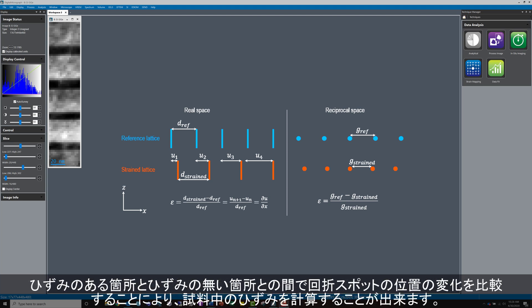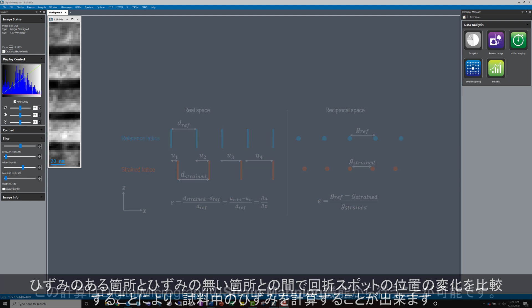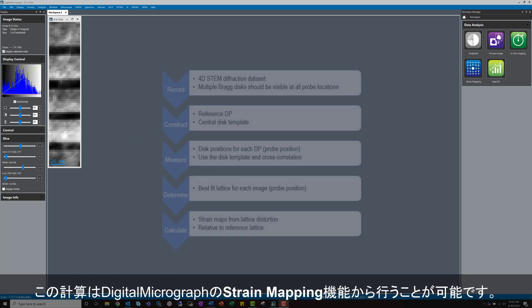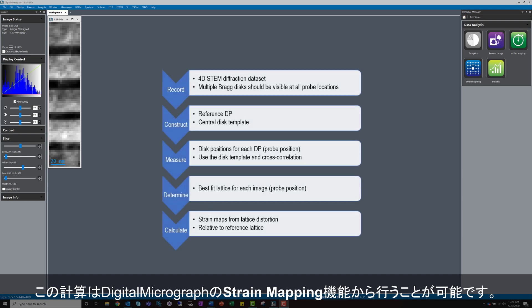If we can measure variations in the positions of diffraction spots from a strained region of the sample, compared to their position in a diffraction pattern from a region with no strain, we would be able to calculate the strain in the sample. The strain mapping technique in Digital Micrograph does exactly this.